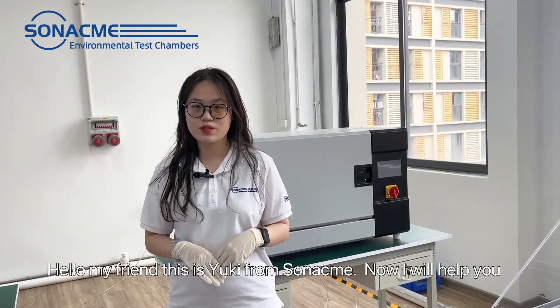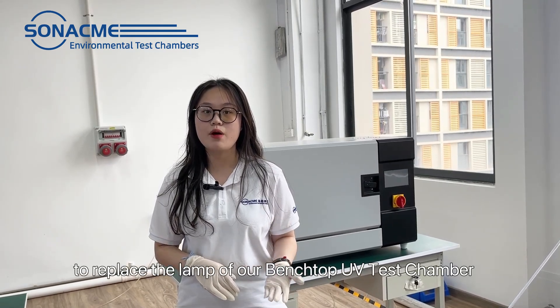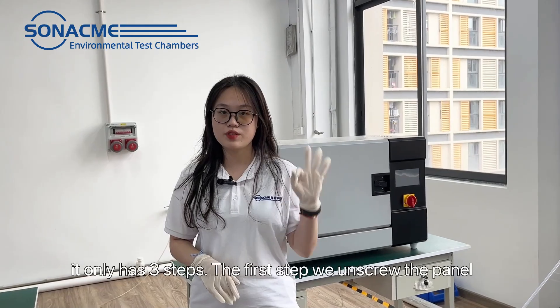Hello my friend, this is Yuki from Sonak. I will help you to replace the lamp of our Benchtop UV test chamber. It only has three steps.